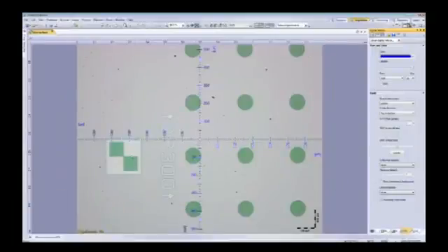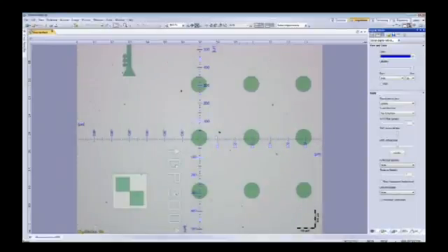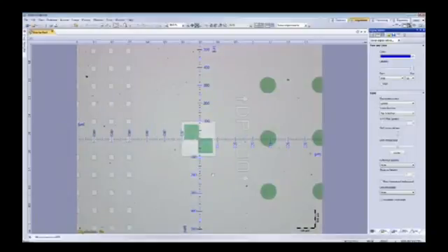We also have a new, with a motorized stage like we have on here, the ability to click to center kind of function. So all I have to do is click on a point? Control and click on a point, and it'll move that directly to center for me. So if we were quickly wanting to measure this box here, we could just put it in between the reticles, touch it up a little bit. We know it's about 200 microns width. This is a way for them not to have to take pictures and manually measure it, just quicker. Drive to the points, move it in between the reticle here, and get a measurement.